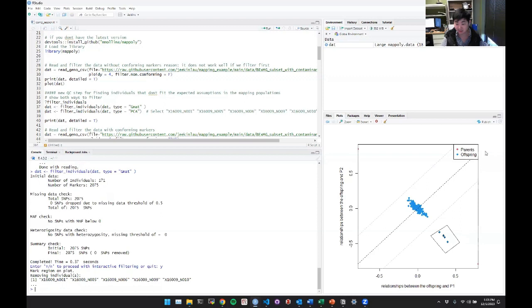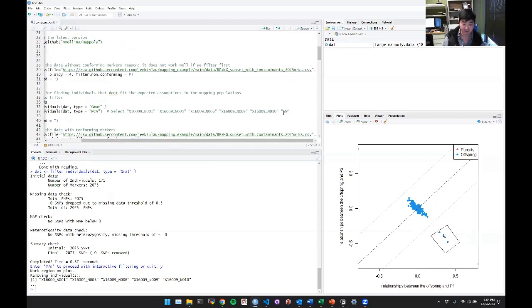You press finish, and it'll box these individuals. But as you see here, you have 4 points. There's 1 point that's overlapping. There's only 5 individuals. I know beforehand, because I introduced the contaminants, that there's one more contaminant, this SW contaminant.